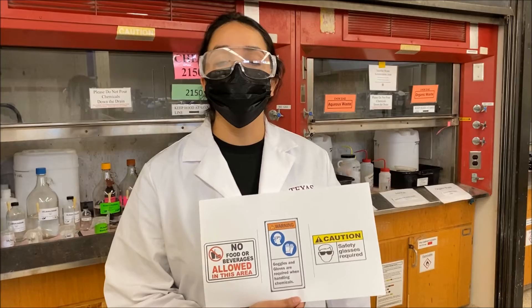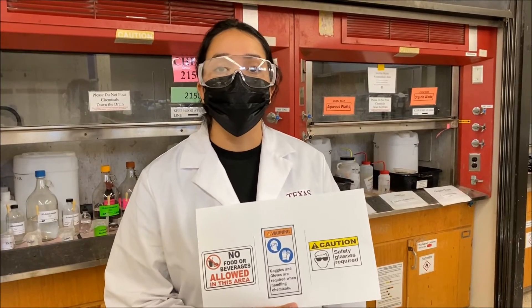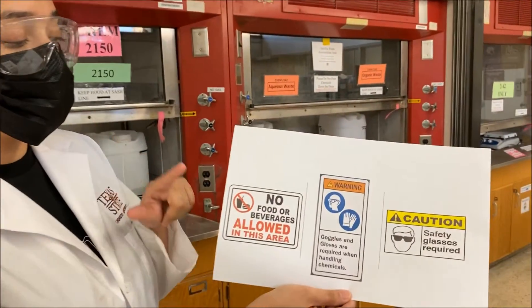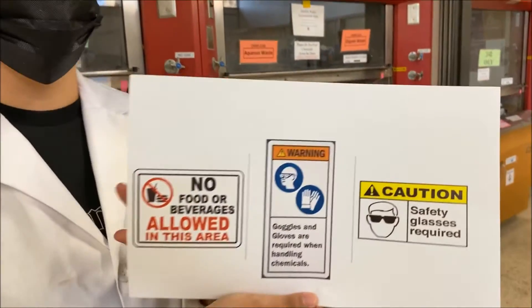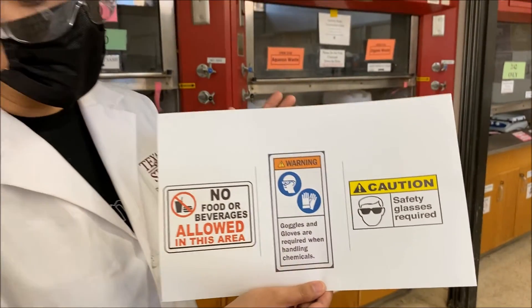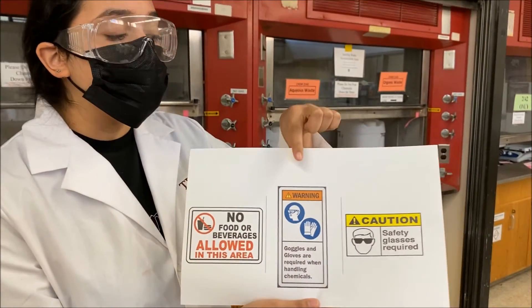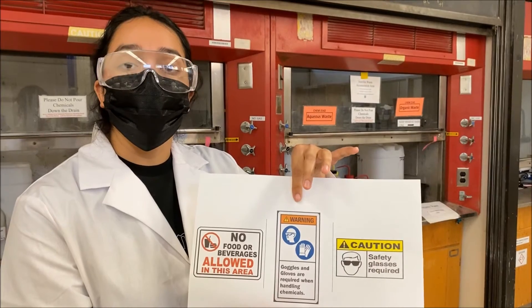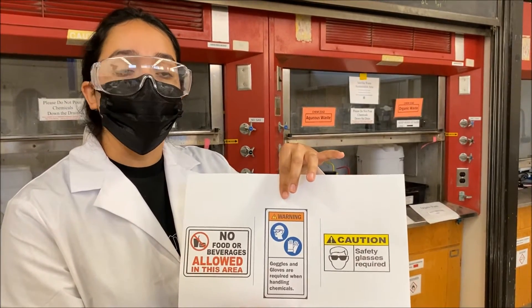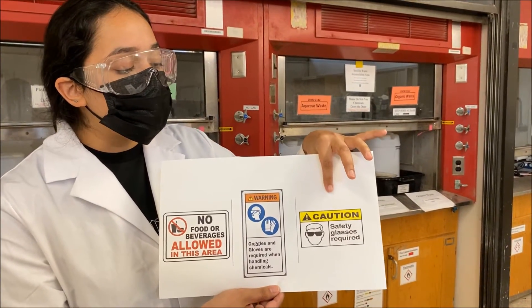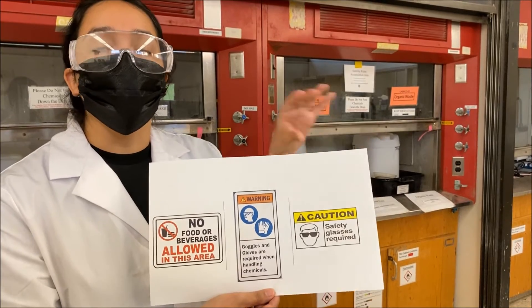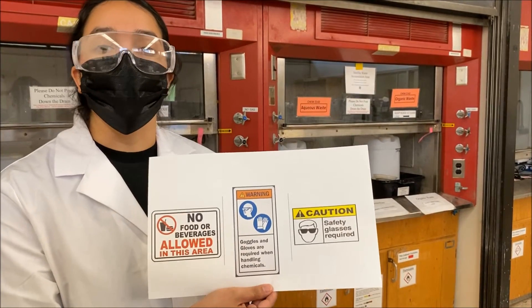Some other important signs to note in the lab: we are not allowed to have any food or beverages inside the lab. You must use gloves and goggles at all times when handling chemicals, and safety glasses are required at all times in the lab.